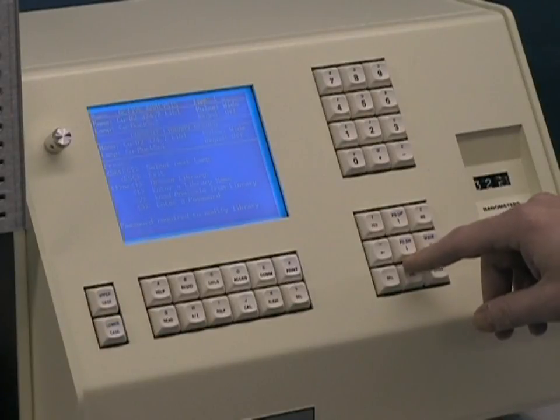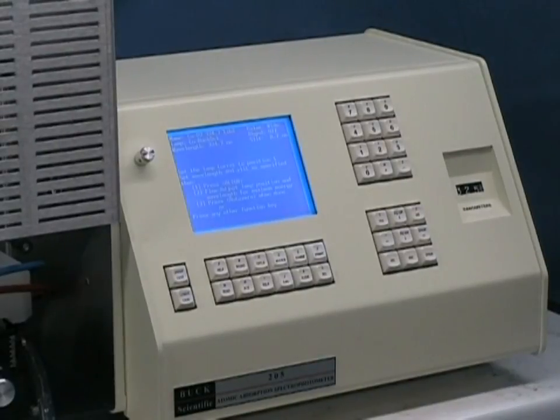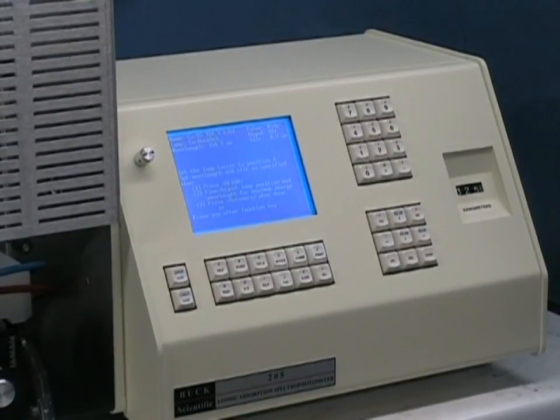As we follow the directions on the alignment screen, you will set the slit size on the right side of the instrument and also approximately set the wavelength. Please be aware that the wavelength counter is an approximate setting and may have a variation of as much as one or one and a half nanometers from the true wavelength position. Once we insert the hollow cathode lamp and go to the alignment mode, we will use the bar graph and energy readings to actually set the specific wavelength.